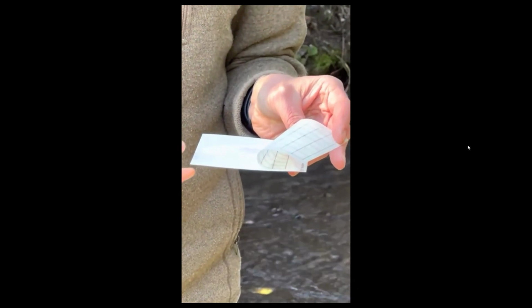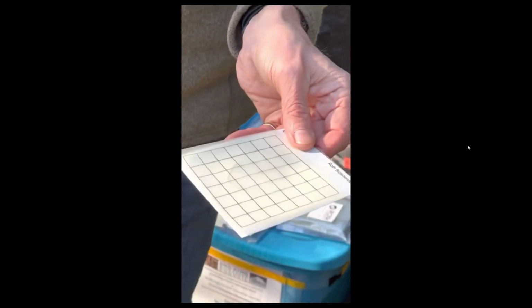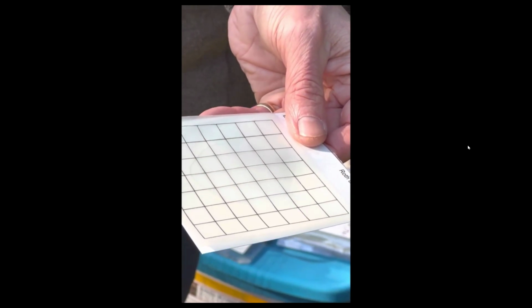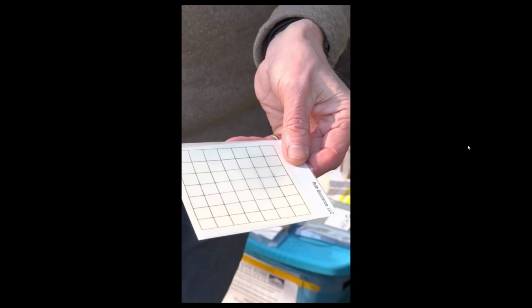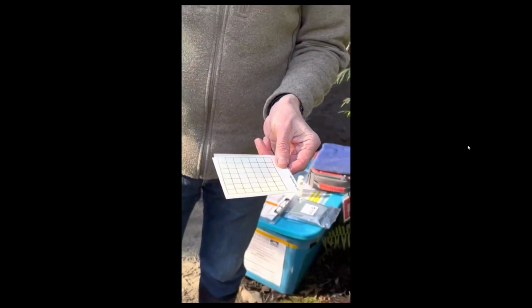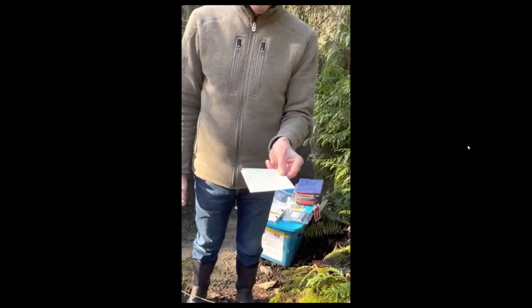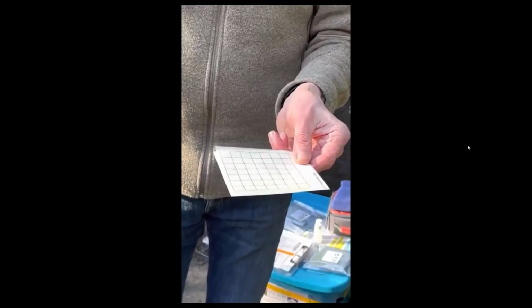So once I've collected the sample, I'm gonna let the lid drop back, the flap, and you can see how it starts to spread out. And the key at this point is just to hold it approximately level. Luckily, this is a card that's designed for a 3 milliliter sample, and we're just collecting 2 milliliters. So it shouldn't spread too far. It shouldn't spread beyond the edges of the card.